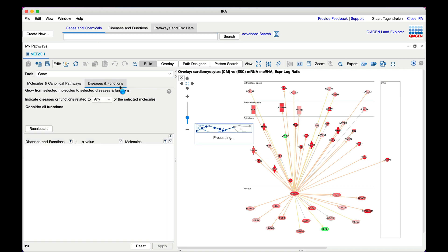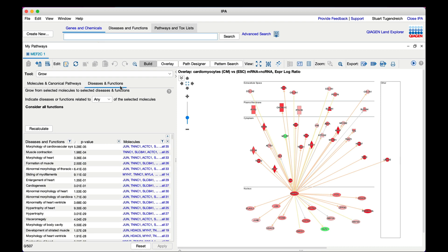IPA will pause while it calculates the right-tailed Fisher's Exact Test enrichment across tens of thousands of functional annotations potentially associated with those genes.